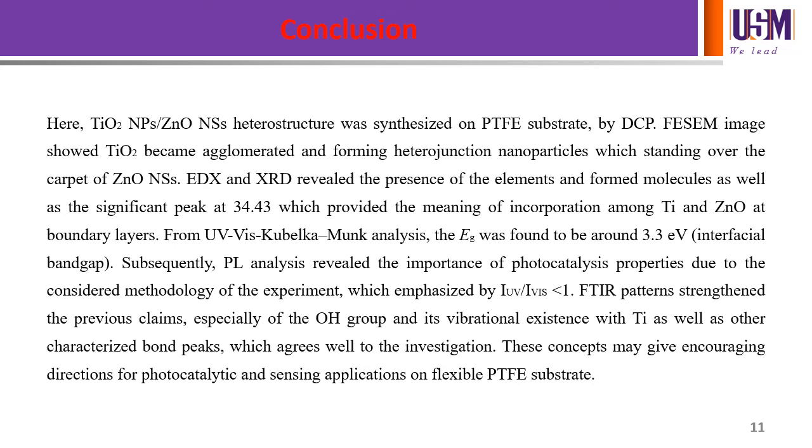The significant peak in XRD analysis was at 34.43 degree, which indicated the incorporation between titanium and zinc oxide at the boundary layers.